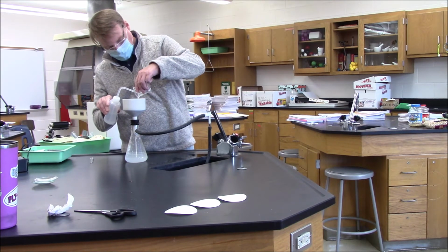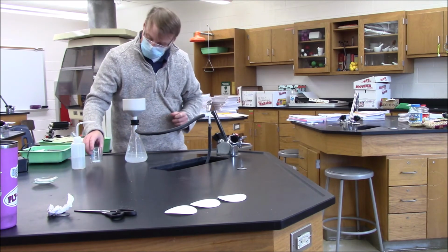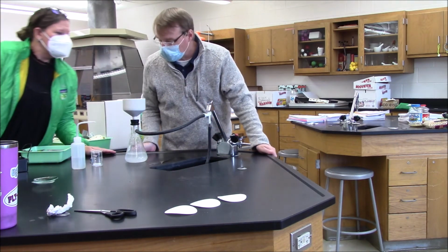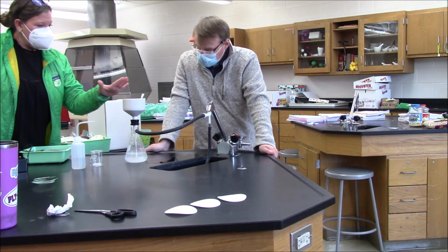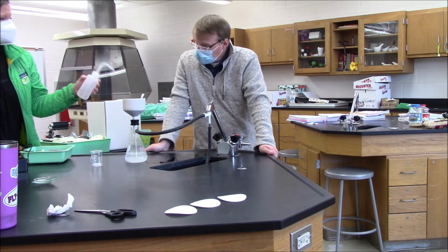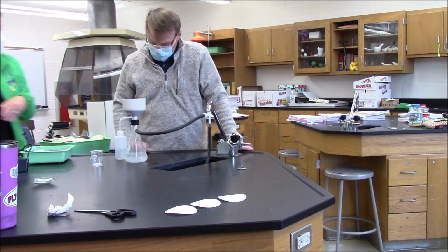All right, that looks pretty good. Now we're going to give it a moment for all the water to pass through. Let me take a look. Doing pretty good. Still going, but that's okay. Once all the water passes through, we're going to rinse it one more time by just pouring some water through here. And then we'll be done.